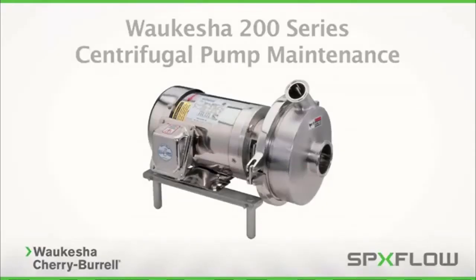From time to time, your sanitary pump requires routine maintenance to ensure peak operating efficiency. This video will teach you the standard service procedures of the Waukesha Cherry Burrell 200 Series Centrifugal Pump.